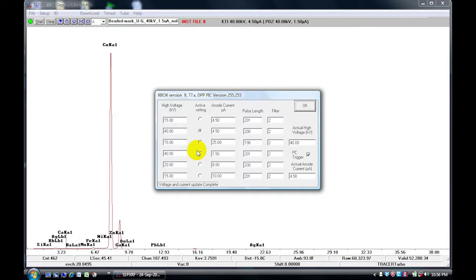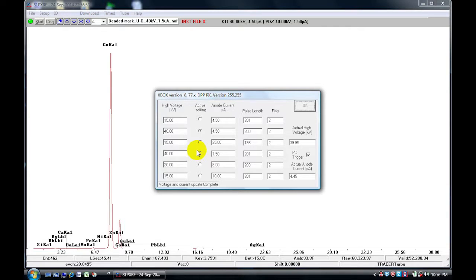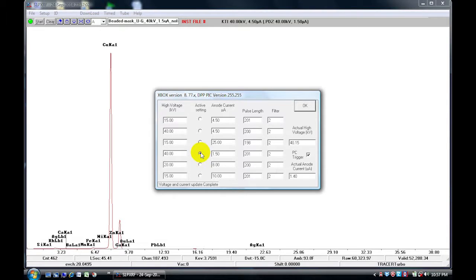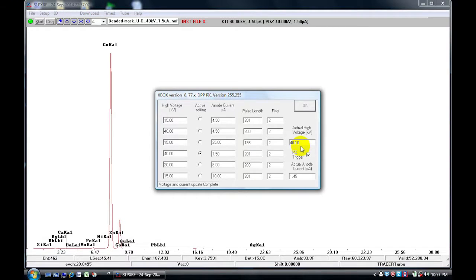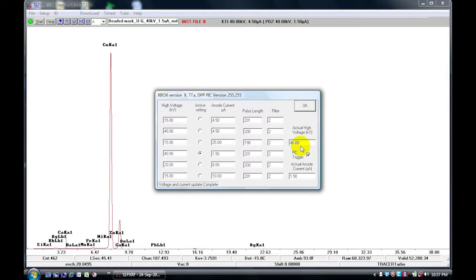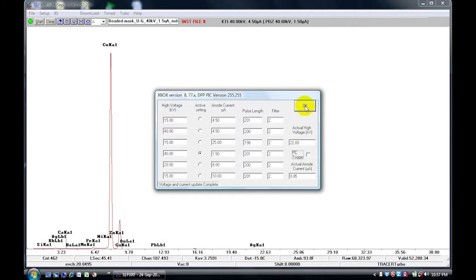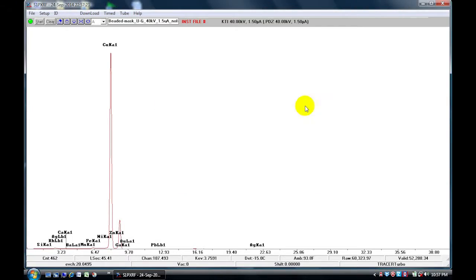What we can do in this window is choose which voltage and current that we would like to use. So we are going to use the 40 kV 1.5. Notice that the voltage and the current now reaches the target voltage and current that is set by our choice. Once that has stabilized, we can unclick the PC trigger and hit OK. This means that your x-ray tube is stabilized and ready to go.